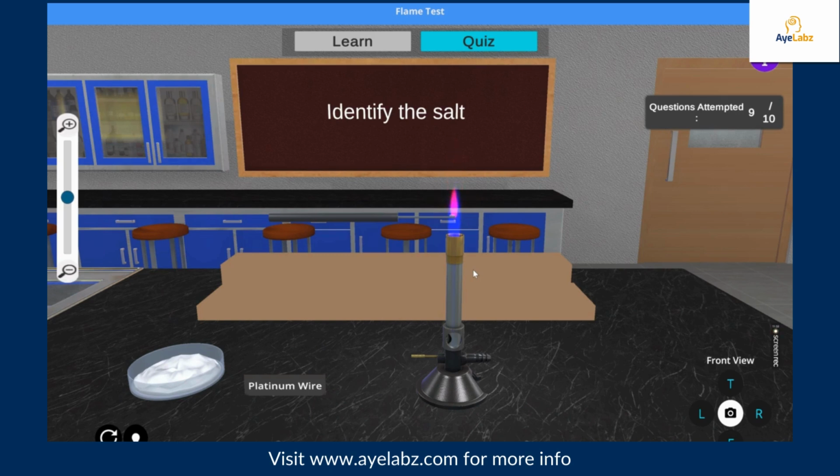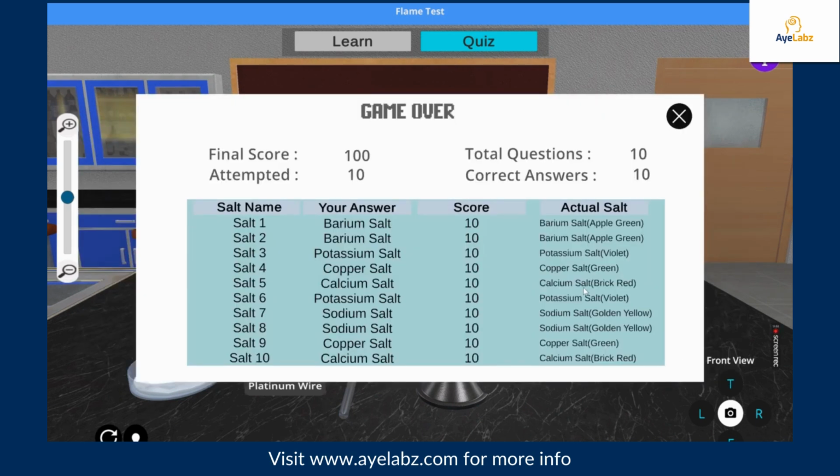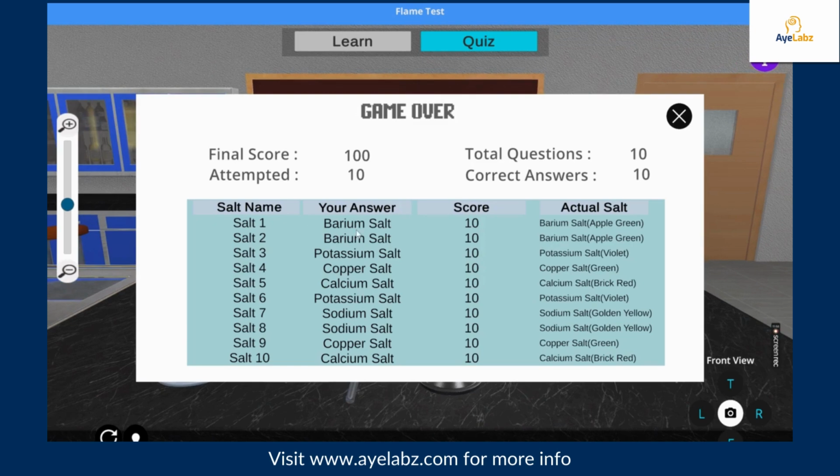Maybe a chance of calcium salt. Once all 10 questions are answered, you can click on finish to reveal the answers. Then the final score, attempted questions, number of correct answers, and the salt name are given over here.